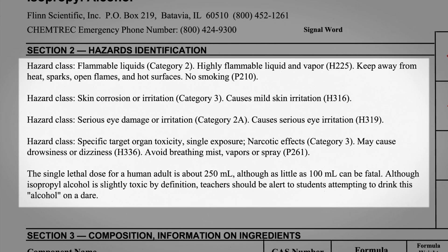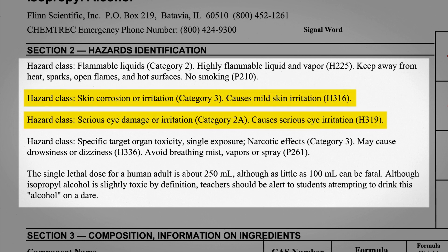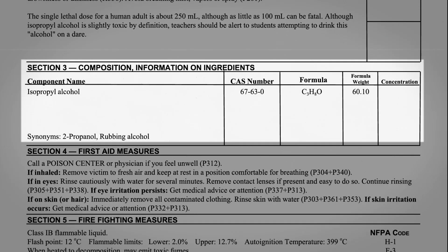Hazards two and three: isopropyl alcohol may cause both mild skin irritation and serious eye irritation. The last hazard class is that it could have narcotic effects — it may cause drowsiness or dizziness. Avoid breathing mist, vapors, or spray. A quick side note: drinking isopropyl alcohol could result in poisoning or even death, so don't confuse it with ethanol found in beer, wine, and liquor.